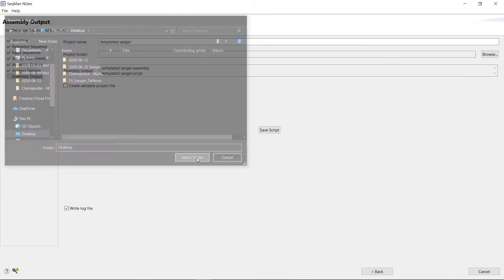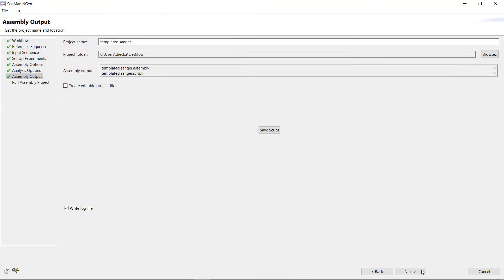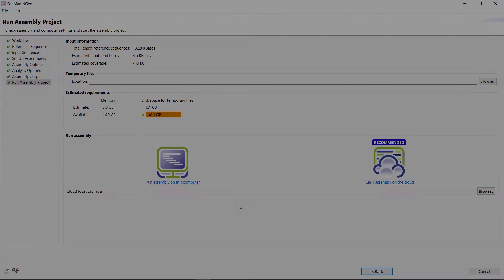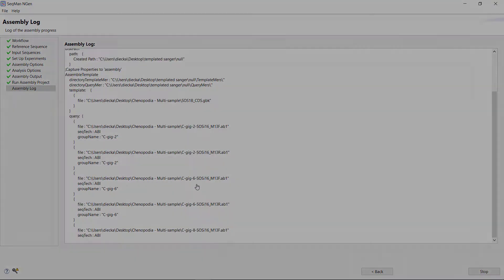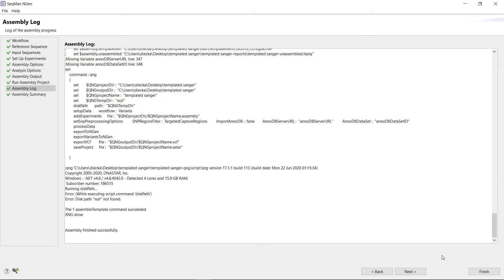Then, click Next. Here, you want to select Run Assembly on this computer. Once the assembly is complete, click Next.